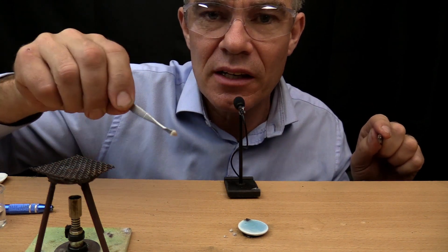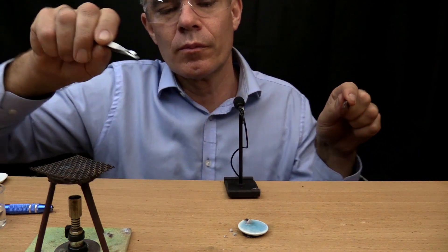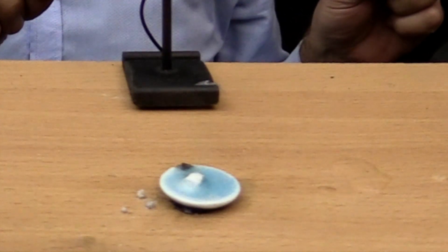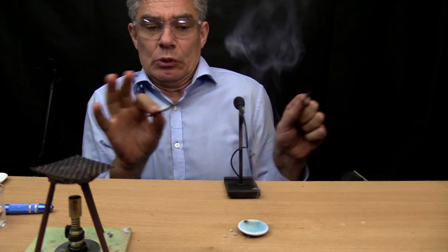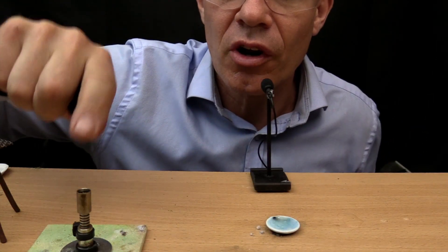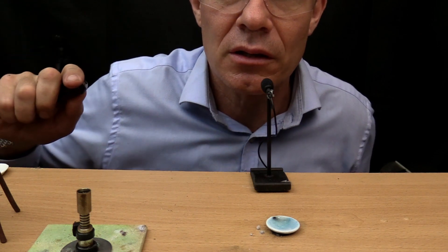I'll put this in and we'll see if it swims around. Yes, it's swimming! Whoa. Very dangerous indeed. I'm going to try and heat a little bit of sodium on the Bunsen burner and see what happens.